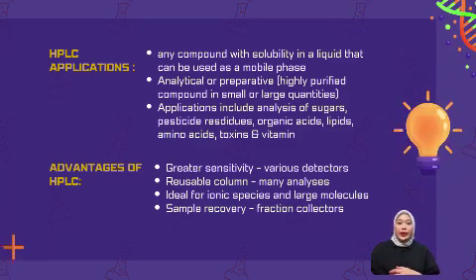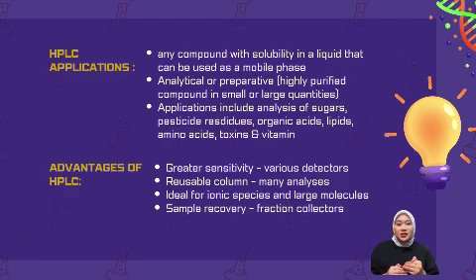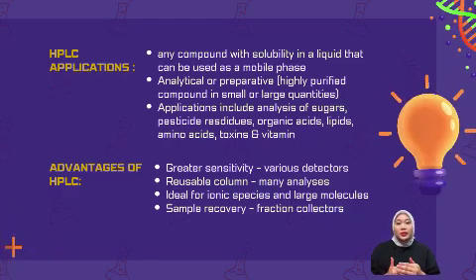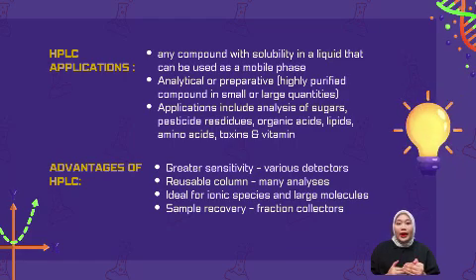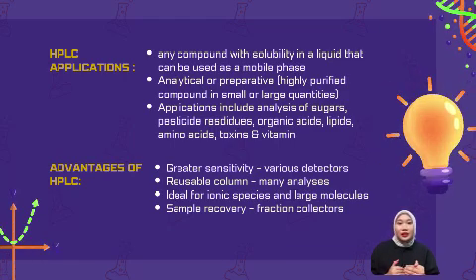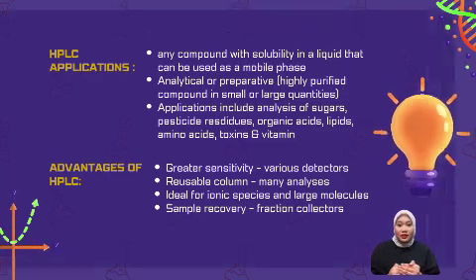toxins, and vitamins. The advantages of HPLC include a greater sensitivity enabled by various detectors, reusability of the column for multiple analyses, suitability for both ionic species and large molecules, and efficient sample recovery using a fraction collector.